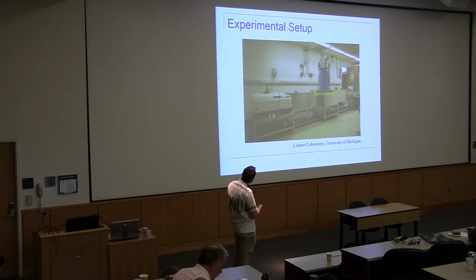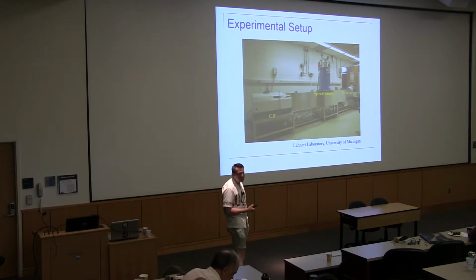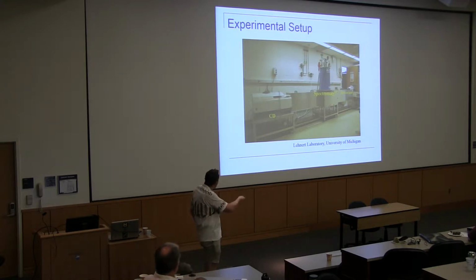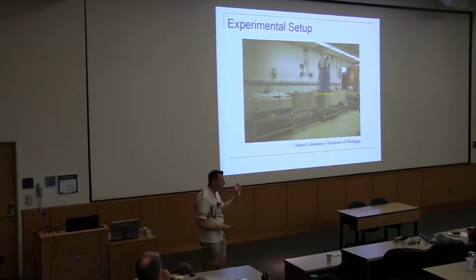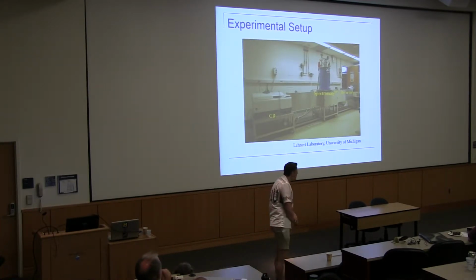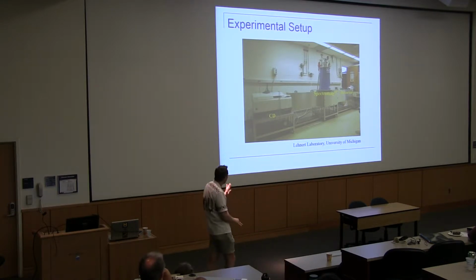The problem with this is that the magnet has a pretty strong stray field, and so you're trying to separate the spectrometer on the one side and the detector on the other side a little bit from the cryomagnet that's in the middle. That's why you have this long setup here. Otherwise, there is really no reason to do this, right? But it's a practical reason.